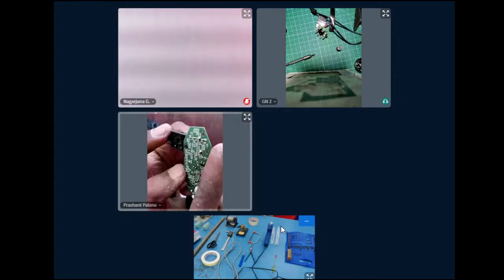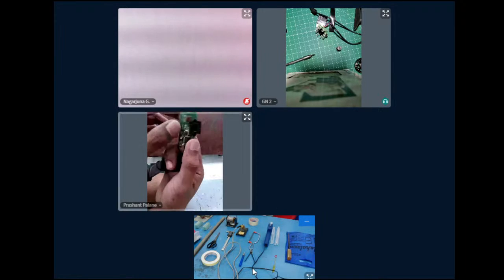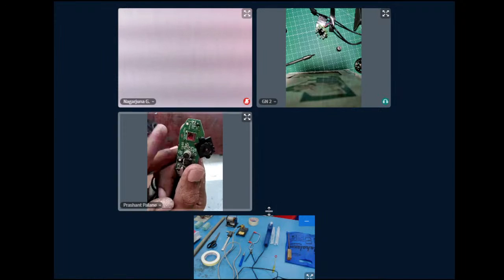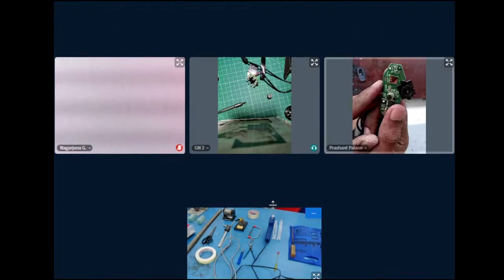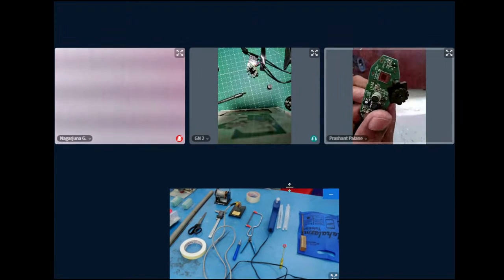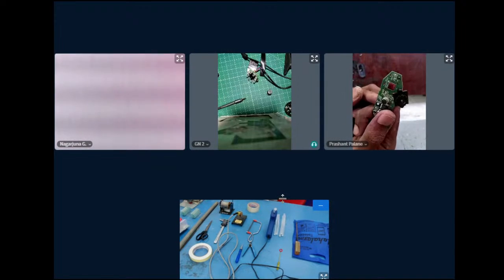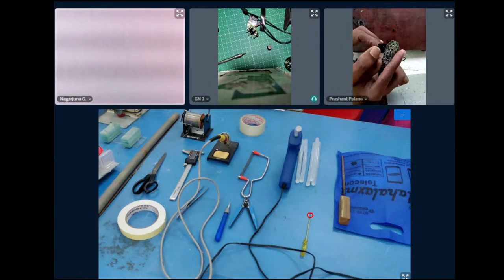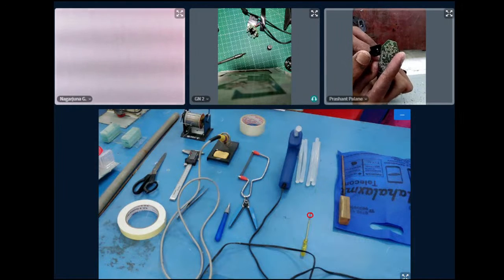No, only the other side. Don't touch that. Don't touch it. I will not touch it. It is clear. Now the same lens has to be mounted upside down on top of it. But you haven't removed the second screw. Yes, it is removed.